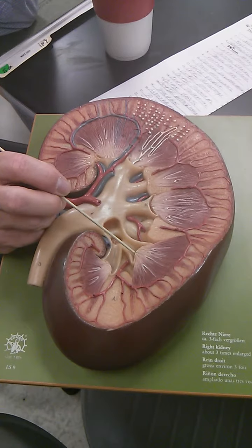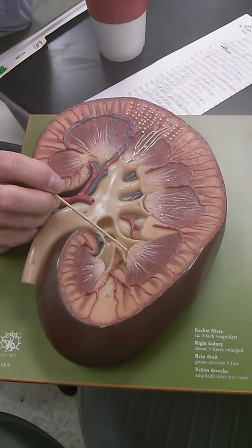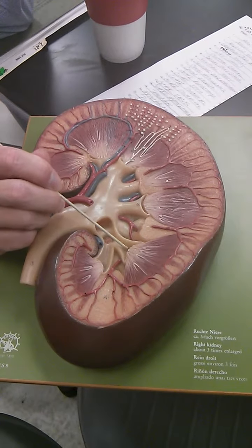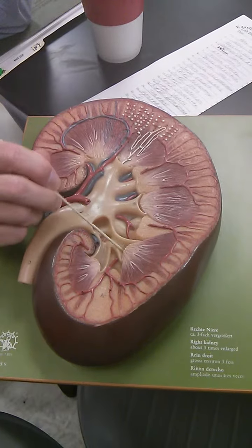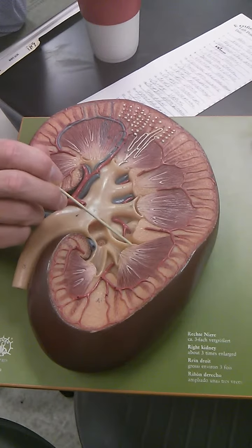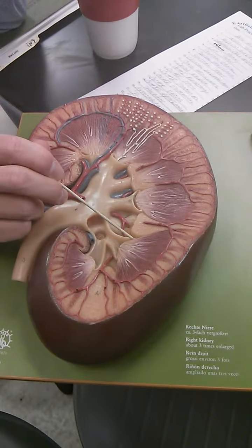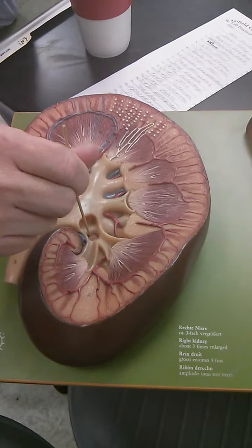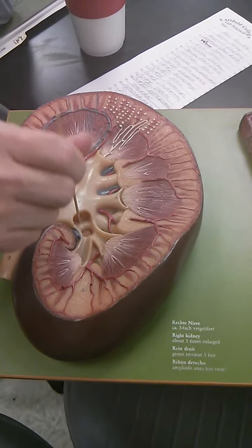Okay. Here's the medullary papillae, okay, the point. Here's major calyx. Minor. This is major calyx right here. Okay. Here's minor calyx. Oh, the sides are minor. The sides are minor, then you come to the major calyx, and then you're into the pyramid. The pelvis. Pelvis, excuse me, the pelvis.